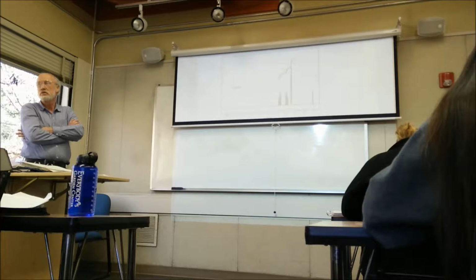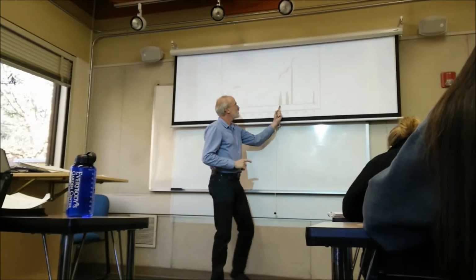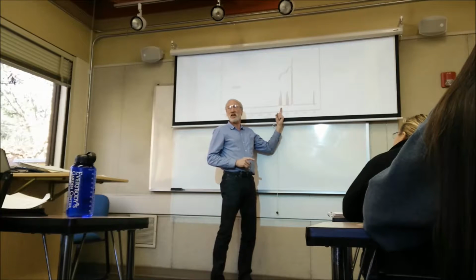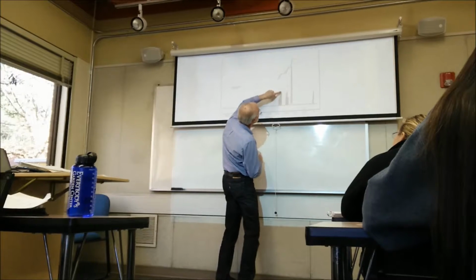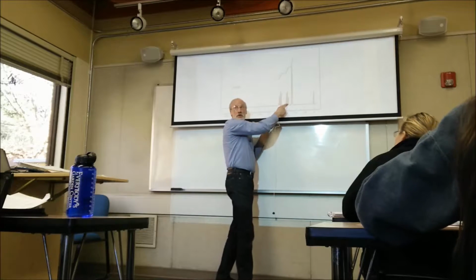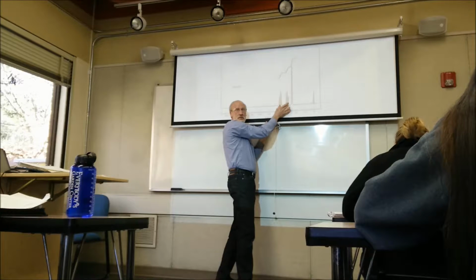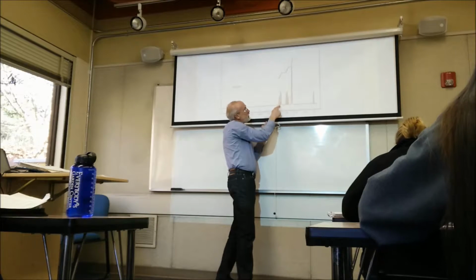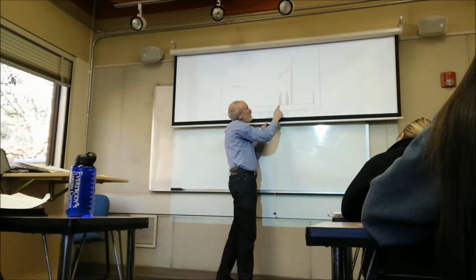of peaks is representative of hydrogens that are around a particular atom. Yes. These represent one subset of the hydrogens in the atom. And all of these hydrogens, this is very regularly split. And you notice that this one points this way and this one points this way. So if this is two hydrogens and this is two hydrogens, and they're splitting each other, they've got to be next door. If these two hydrogens are being split by these two, you should get a triplet. And if these two hydrogens are being split by those two, you should get a triplet.